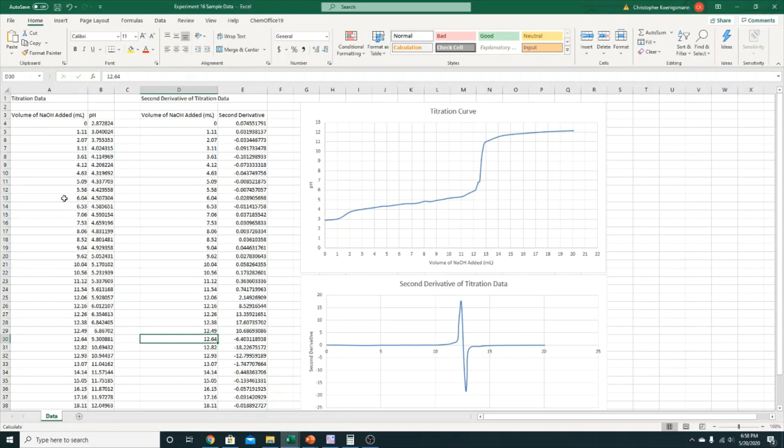So, again, we're going to have to go in and find, let's say, for example, the value was, it's not going to be this, but I'm just giving an example. Let's say the example is 4.4. You calculate the half equivalence point should be at 4.4. It's not going to be that, I'm just using it as an example. But anyway, the two data points that straddle 4.4, 4.12 is on the low side and 4.63 is on the high side. We could go in here and take an average and that would be pretty good.